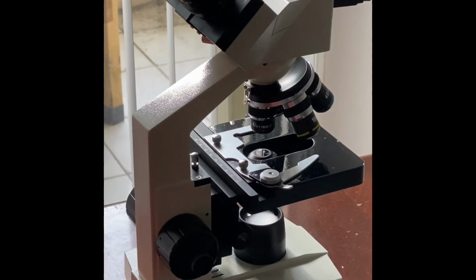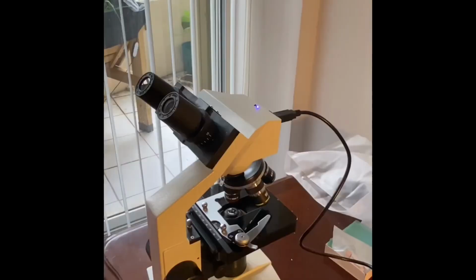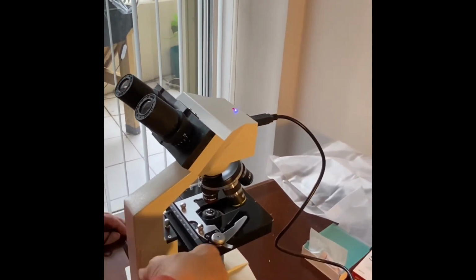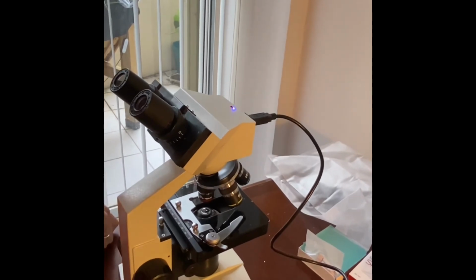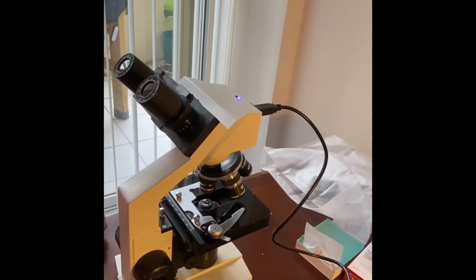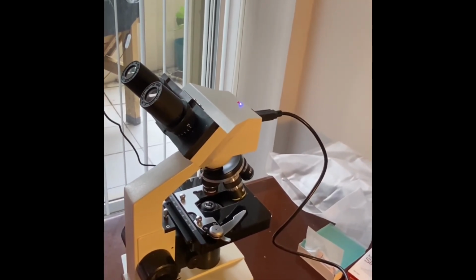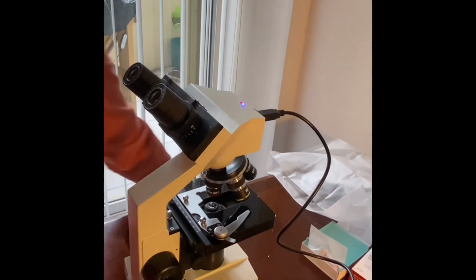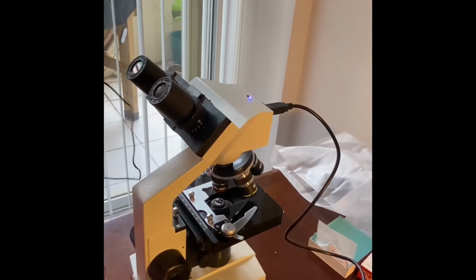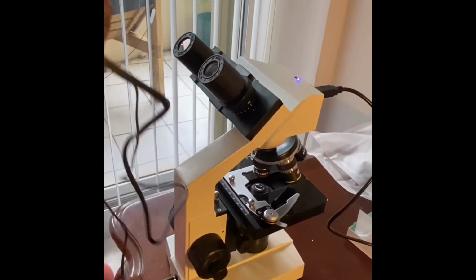Okay, so now we are ready to shut down the microscope. Next, now that you have your light off, you take out the microscope from the electricity, and you have a coil. Here is the cord to your microscope.